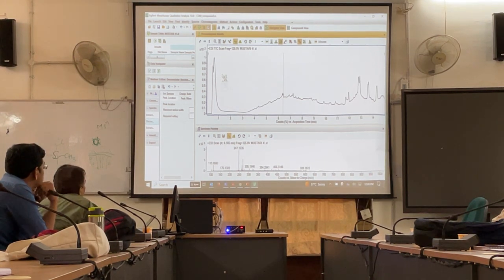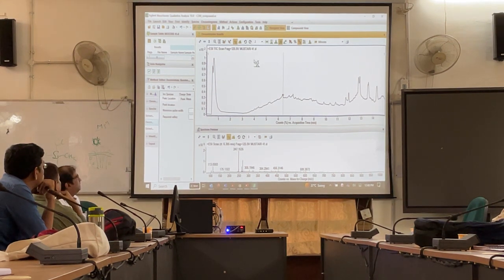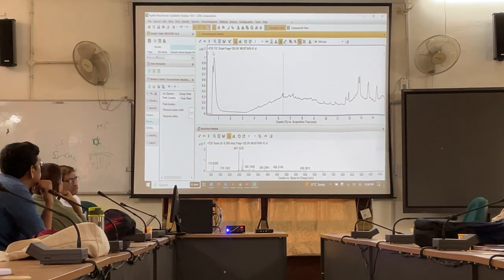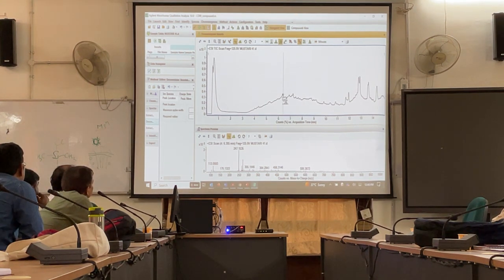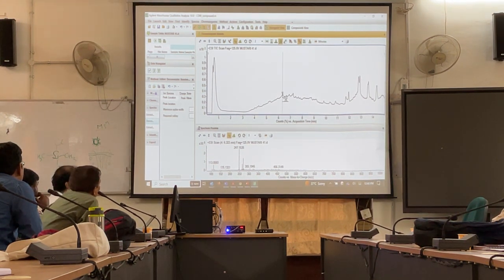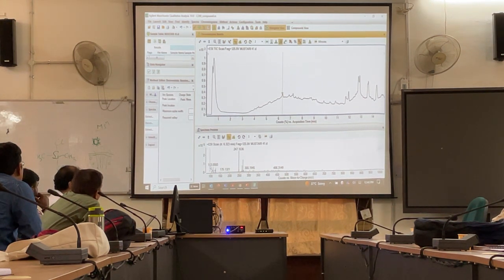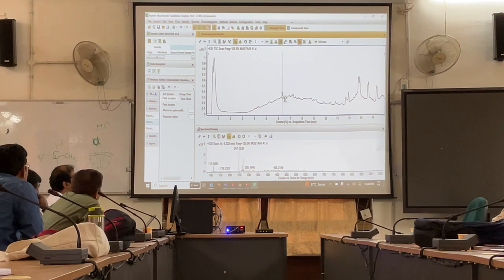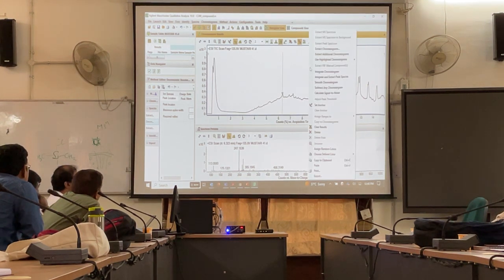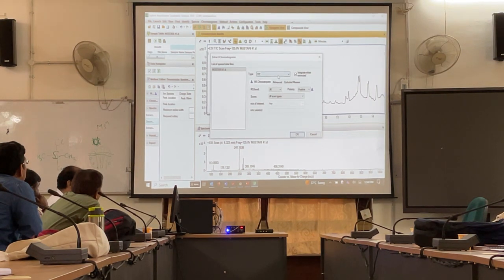Now, this is what we call TIC. Can you see here? TIC, total ion current. The problem with this TIC is that everything is coming and it is represented here. If you see here, there is a peak of 247, there is a peak of 305, 113. The combined intensity of all these peaks will give you this intensity which is here. Now, if we right click and say extract chromatogram and say extract BPC.